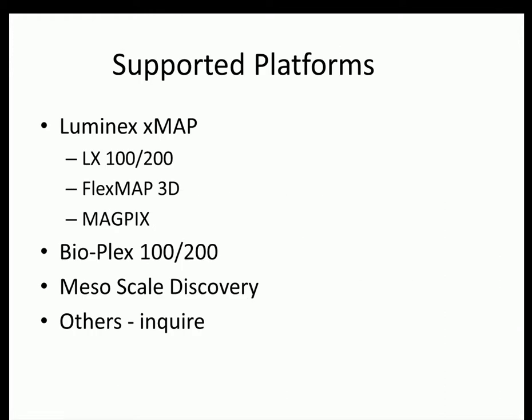So MasterPlex QT will import raw data files from all of these platforms here: the Luminex XMAP platform, including the LX100 and 200 instruments, FlexMap 3D, and the MagPix instruments. Also the Bio-Plex 100 or 200 instruments from Bio-Rad, and the Meso Scale Discovery sector instruments, data that comes out of their Discovery Workbench software. So MasterPlex QT can import raw data from all three of these platforms, and in some cases there are multiple instruments in each platform.